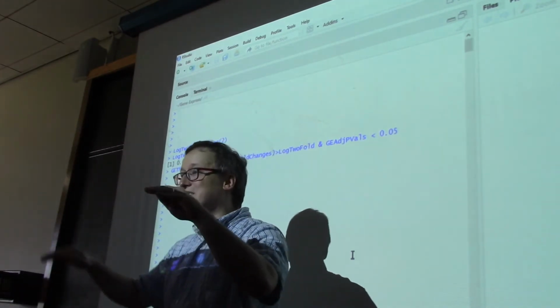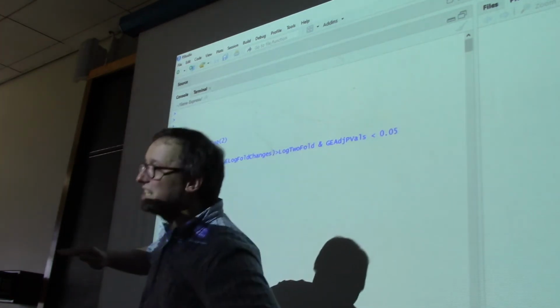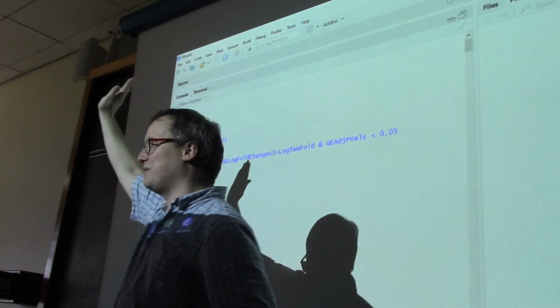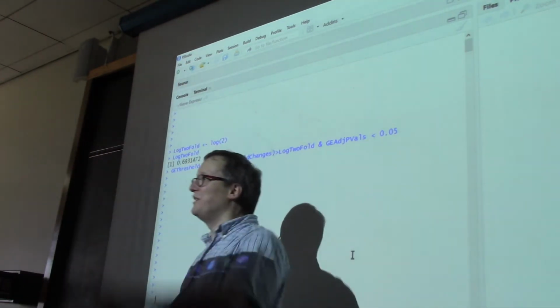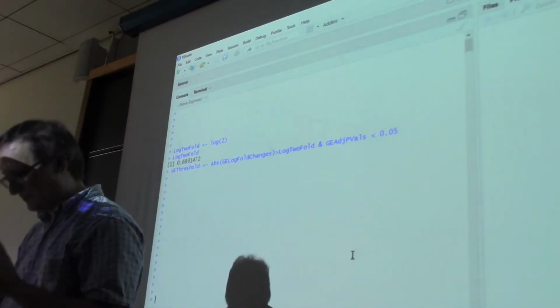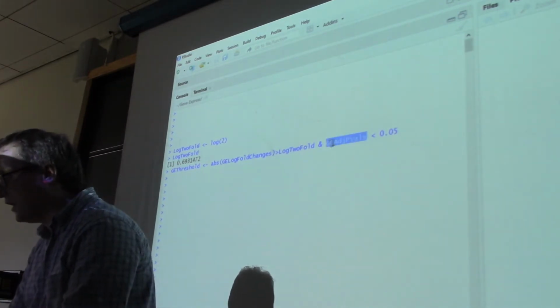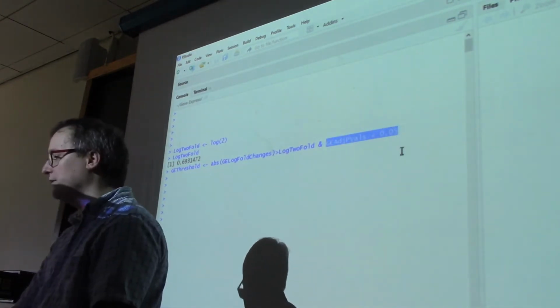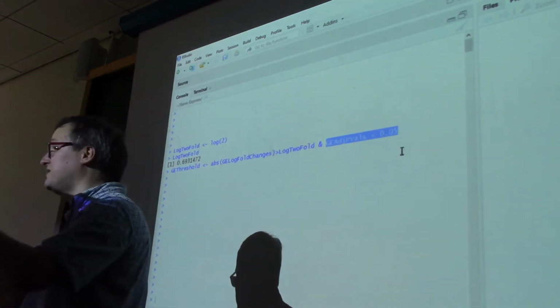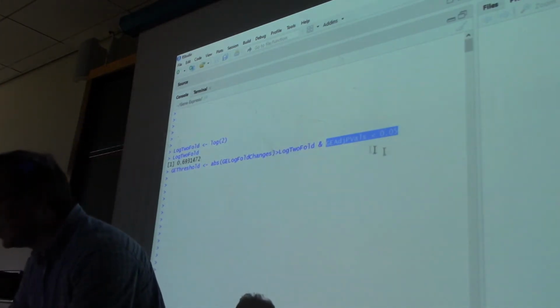So to say this in two different ways, we want an adjusted p-value that's less than 0.05, which means that we want a nice and high negative log p-value. So a low p-value makes it higher on the volcano plot. Sorry, that's an easy place to get confused. So we want to see that the adjusted p-value is less than 0.05 if we're going to call this a hit. And we're only going to use adjusted p-values here, only those that have made it through multiple testing correction.